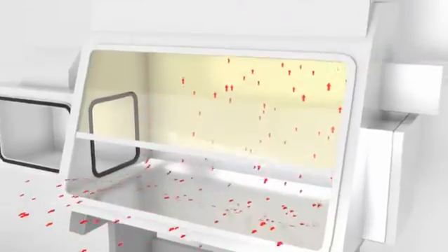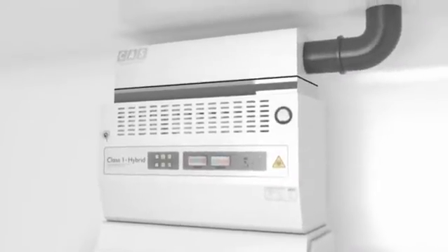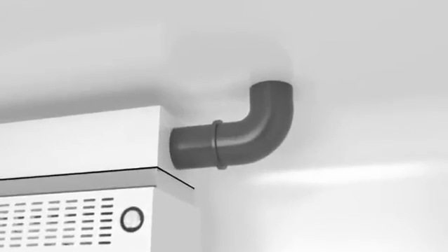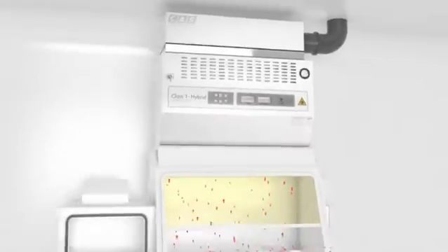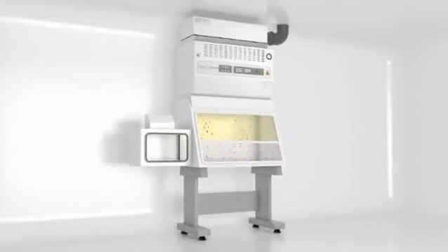The air from the cabinet is exhausted through double high efficiency particulate air filters, HEPA filters, either to the outside of the building through the building exhaust system or in the case of a recirculating type, back into the laboratory airspace.